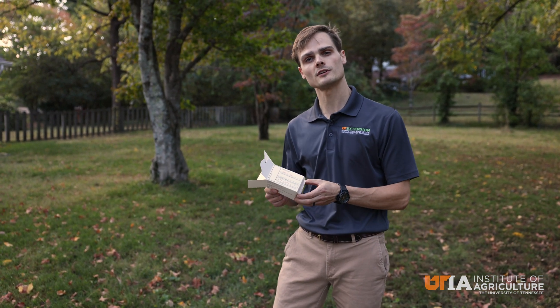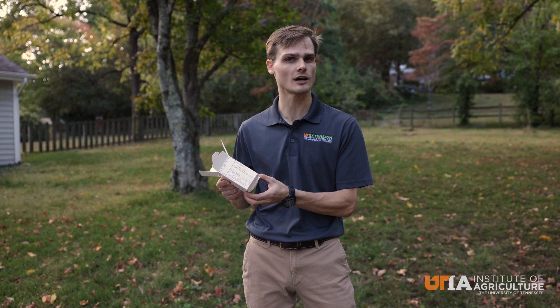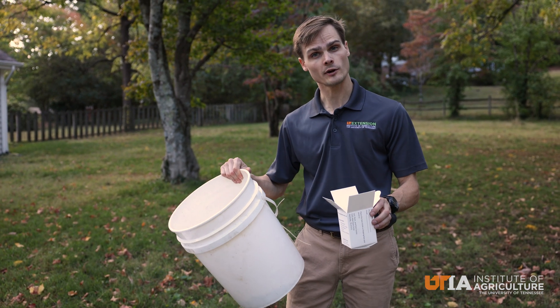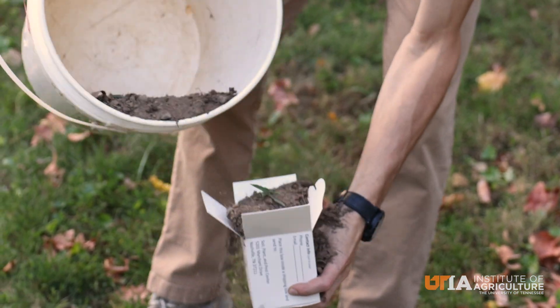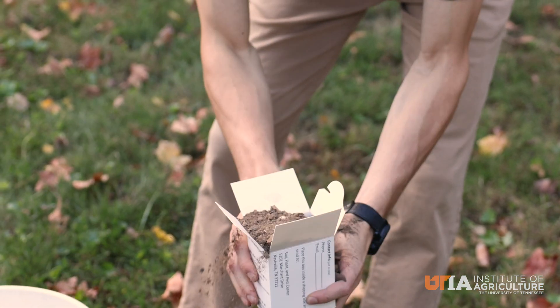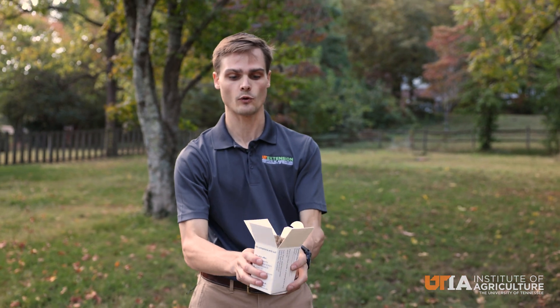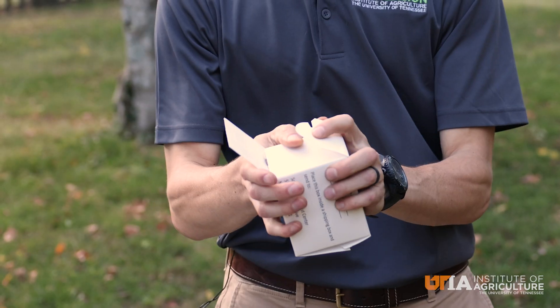Now that we've collected at least 10 locations that will be our representative sample, I have here a soil box that can be picked up at a county extension office, and we're going to transfer that soil from the bucket into the sample box. Make sure we fill this up all the way so that the soil analysis lab has plenty of soil to analyze. Then we'll fold that up.